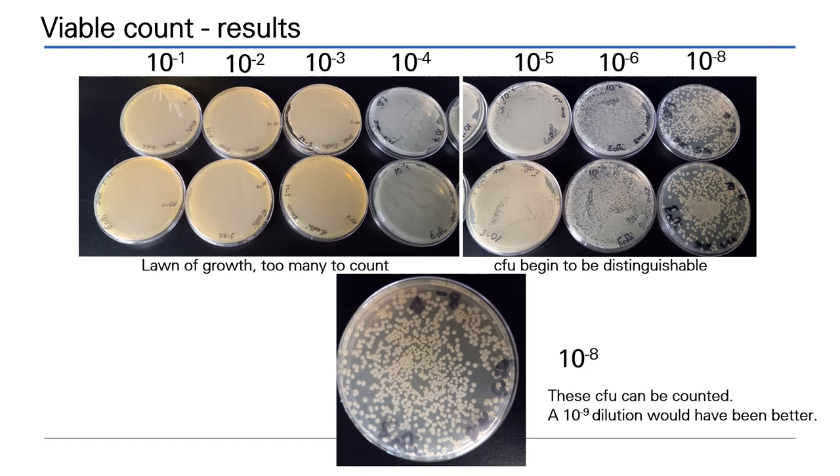These are the results of the viable count technique. We only demonstrated the dilution of the 1 times 10 to the minus 1 through 1 times 10 to the minus 3 plates. As you can see in the panel, 10 to the minus 3 still produced a lawn of growth. A lawn of growth is when all of the colony forming units are so close together and so numerous that you cannot see the individual colonies. So, the serial dilution was performed all the way down to a 1 times 10 to the minus 8 dilution.